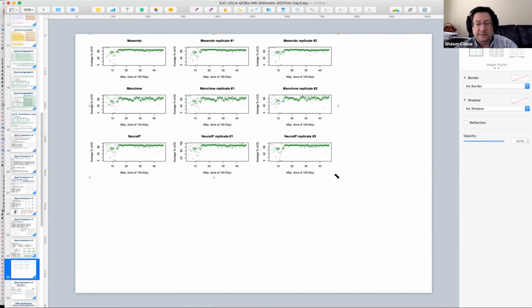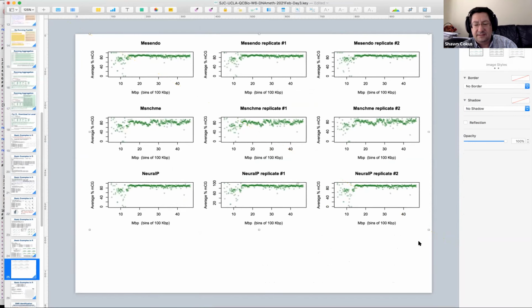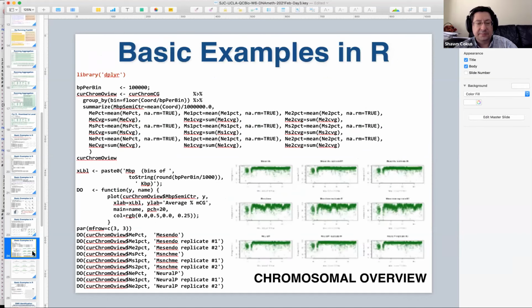This is as big as you can get. Yeah, you can see a little bit. The effect is probably better with the 10 KB plots, where the transparency helps. But there you go. You see these in papers all the time.